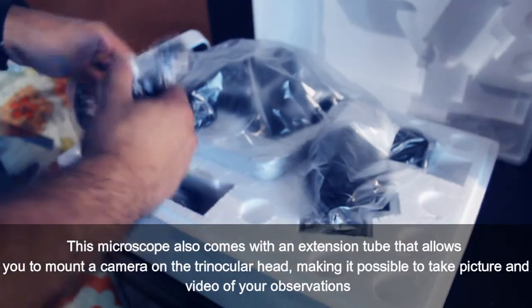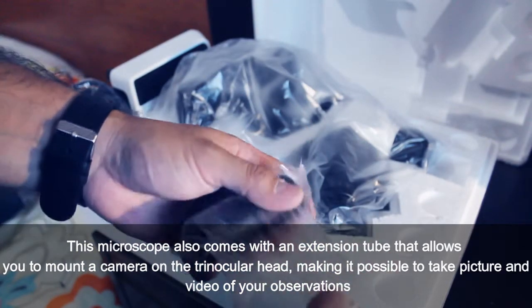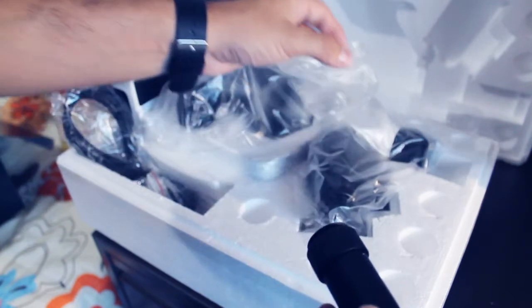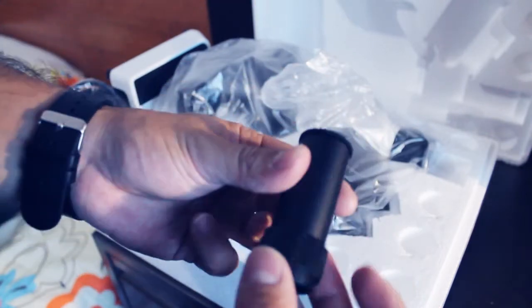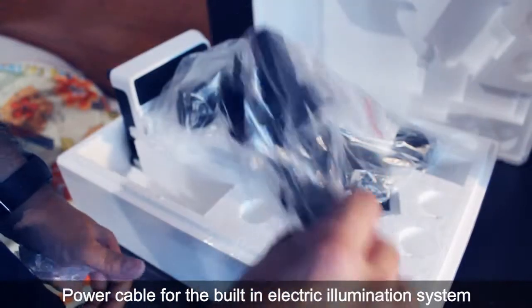This microscope also comes with an extension tube that allows you to mount a camera on the trinocular head, making it possible to take pictures and video of your observations. This is a power cable for the built-in electrical illumination system.